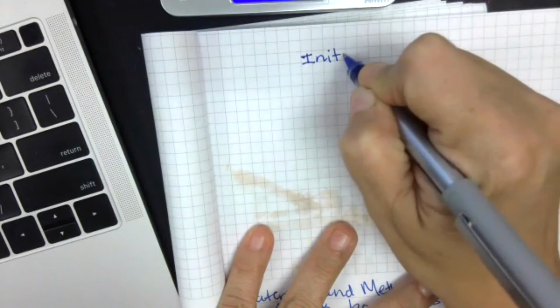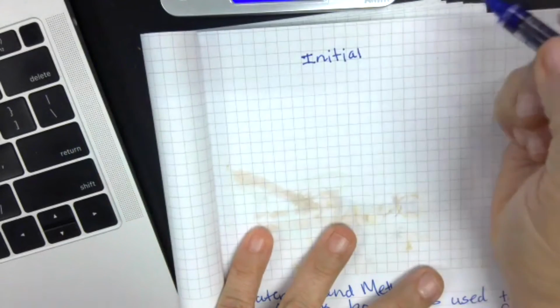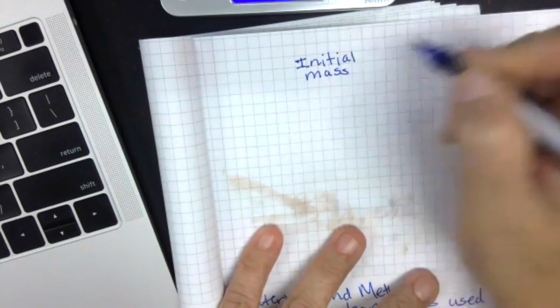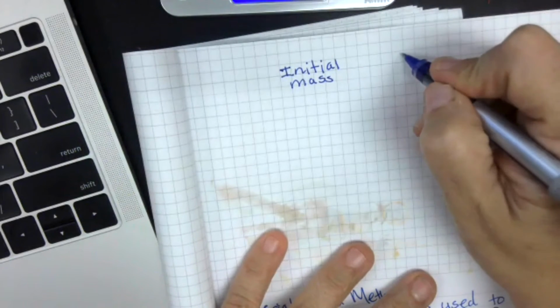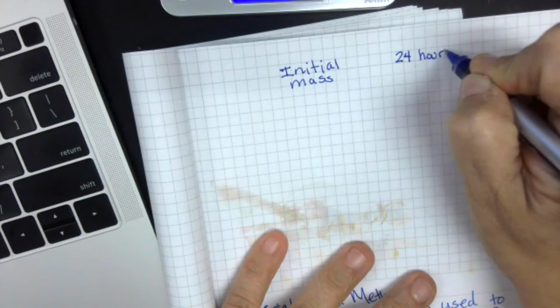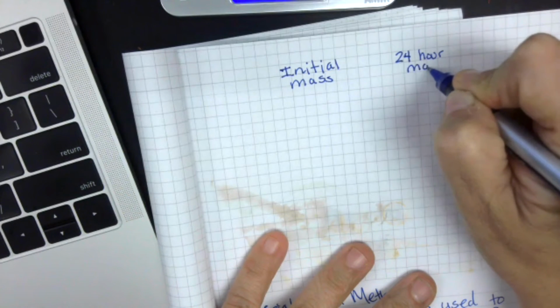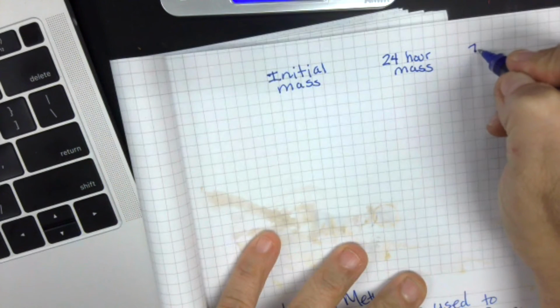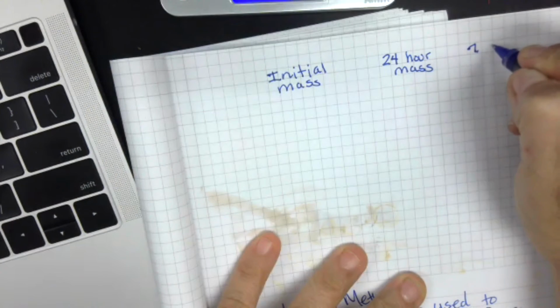I'm really bad at making tables on the fly. And then this is going to be a 24-hour experiment, so this is a 24-hour mass. And then we want to calculate the percent change.